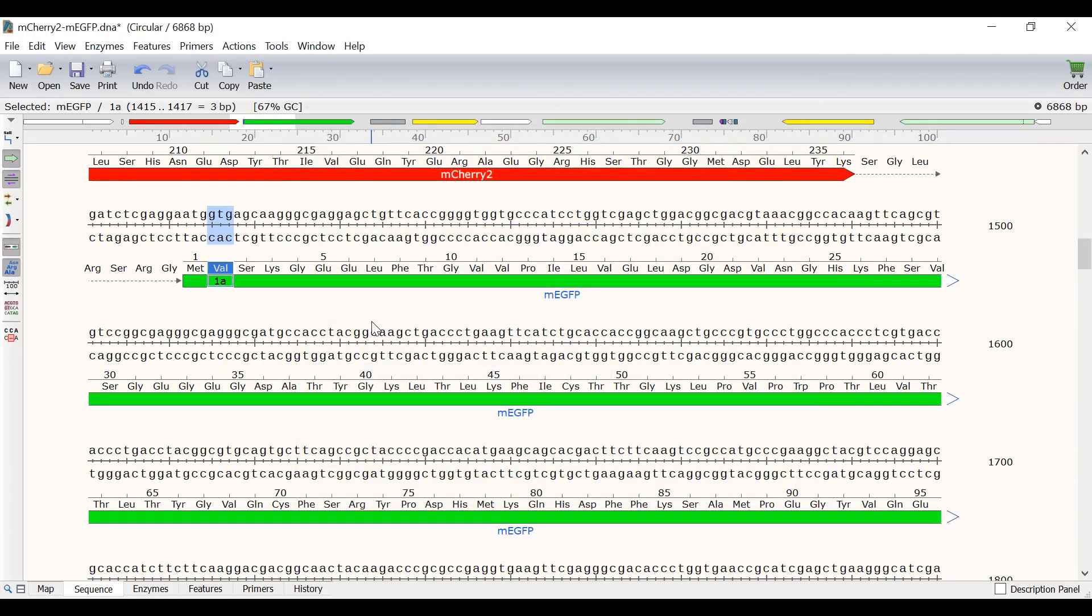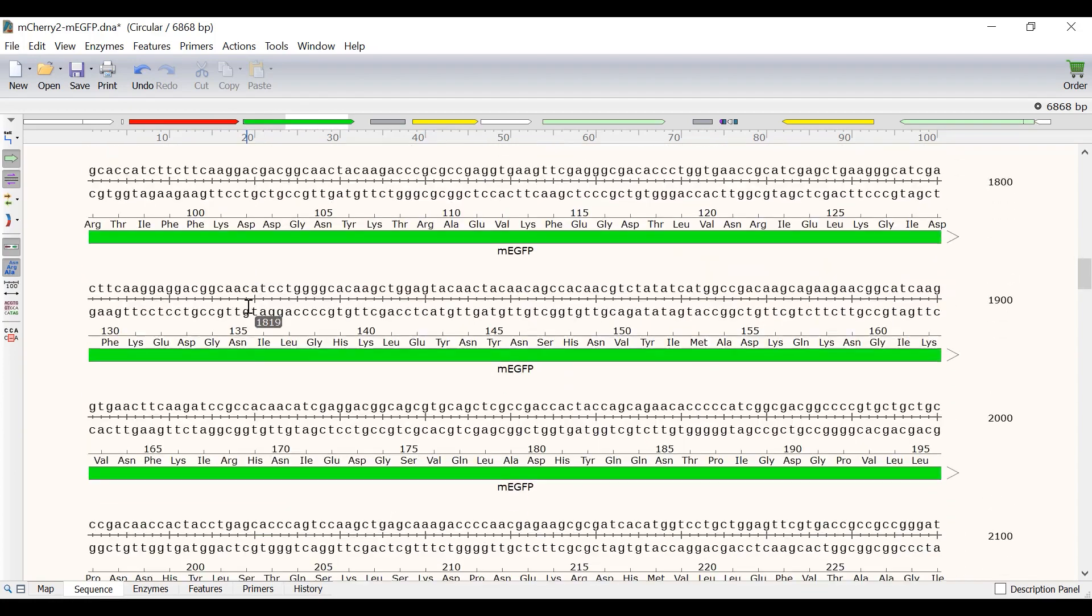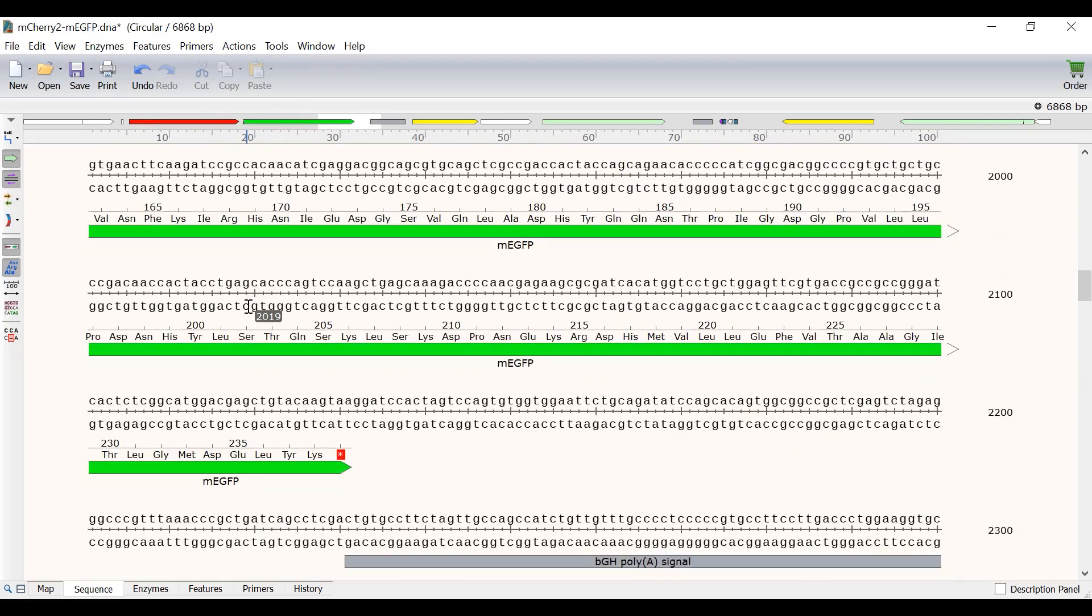Now I will return to the sequence view by selecting OK and OK again. I can now see that the numbering skips over valine 1A. And if I scroll down, I can see that the lysine is at position 206, as it should be.